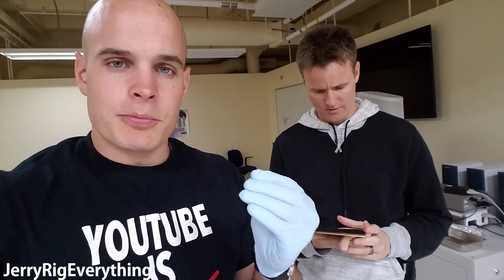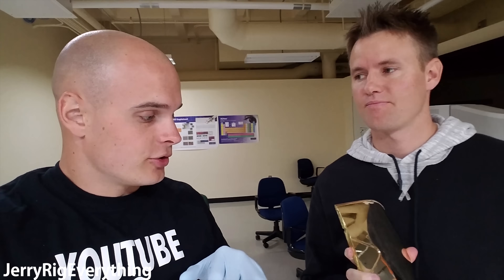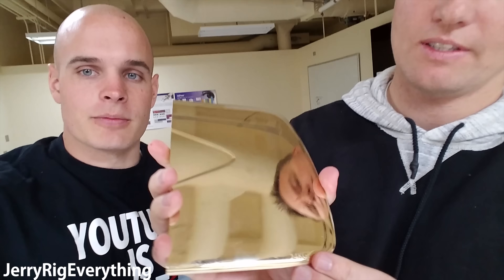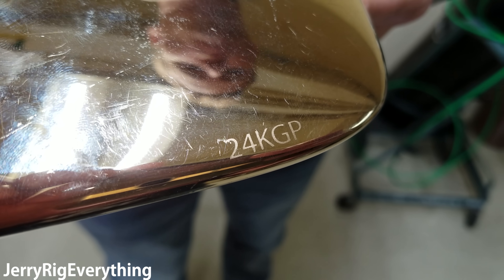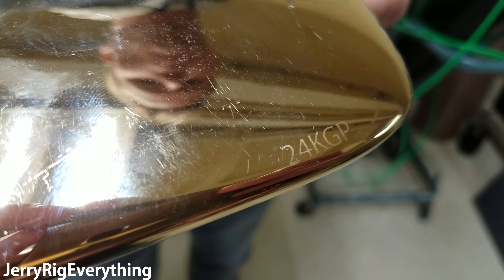We're done testing the top part. I'm a little surprised — I didn't see as much gold as I thought there would be. Right here on the bottom it says 24 karat gold plated. And 24 karat gold is known as pure gold — 100% gold or 99.9% gold. So let's flip it over and stick the back in and see if it's plated on the back.